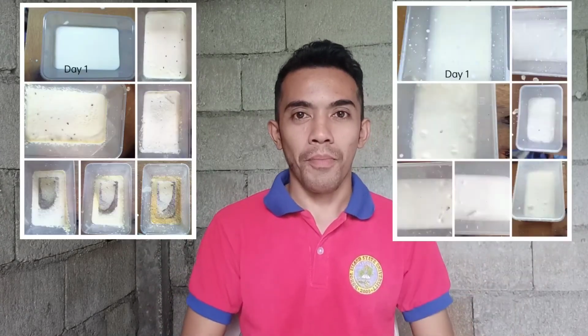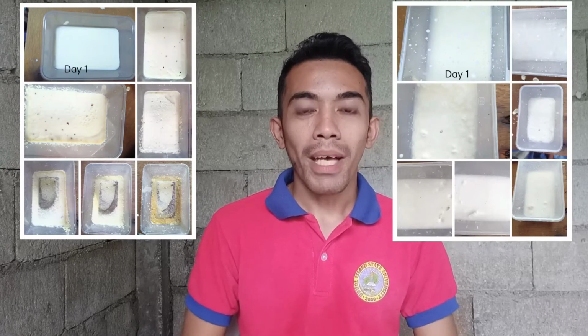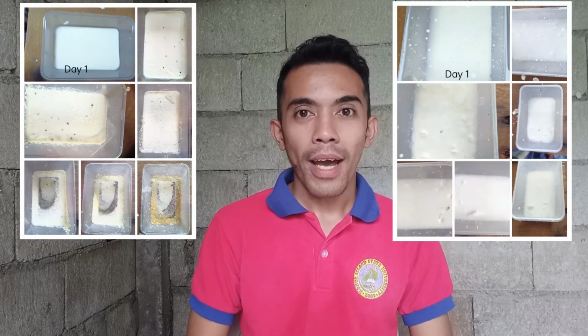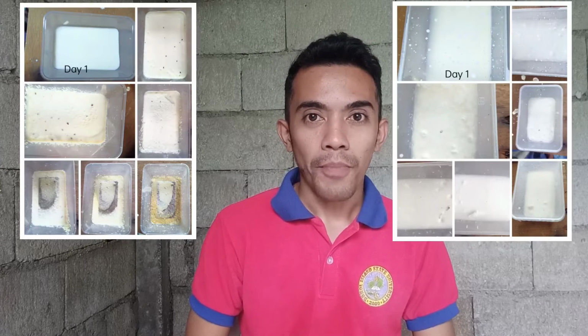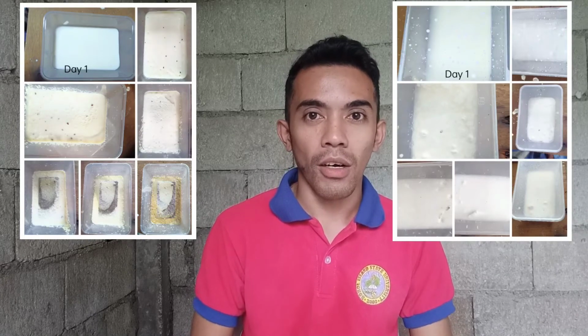Second, milk. Open system, closed system. For the open system, the milk spoiled quickly. The milk texture becomes thin and the volume of milk decreases. While for the closed system, the milk spoiled slowly. We can see that two layers formed and there are no texture changes in the milk. Why?